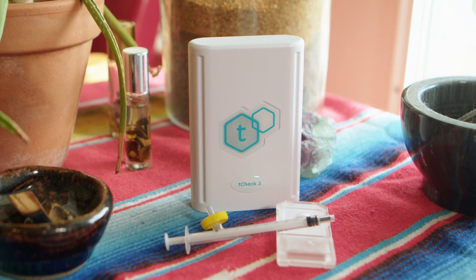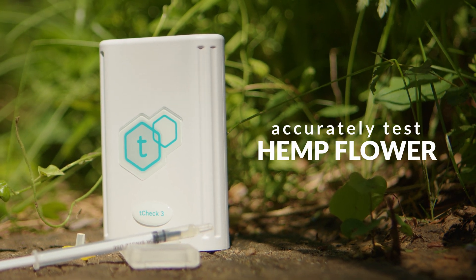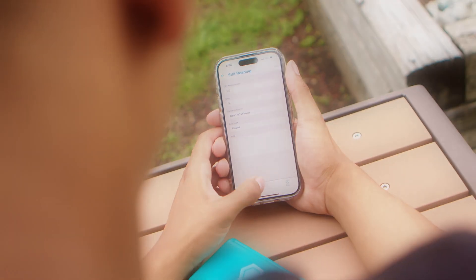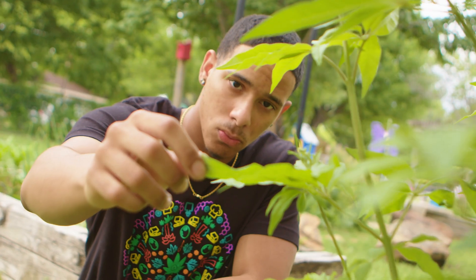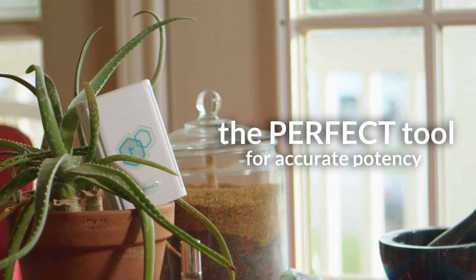T-Check 3's newest feature gives you the power to accurately test the potency of your decarbed hemp flower. You can expect the same testing capabilities as the T-Check 2, but with improved test-to-test repeatability and enhanced accuracy. Whether you're a home grower, a cannabis enthusiast, or a professional in the industry, the T-Check 3 is the perfect tool to ensure you know exactly how potent your products are.